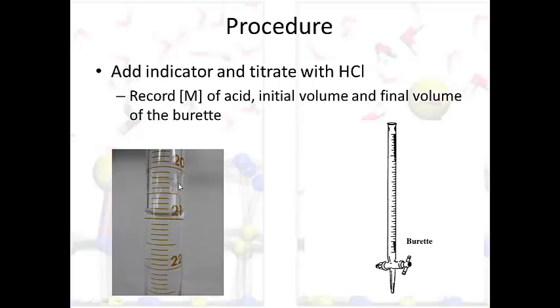So in this case, you can see how the burette's graduation markings here are upside down because we are dispensing. So here's 20, 21, and 22. This starts out at 20. It's more than 20, but less than 21. And then you can measure quite easily these graduations. There's 5, 6, 7, 8, 9, and that would be the 21 mark. But you can see that you can estimate that this meniscus is between the 20.9 and the 21. So I would read this as 20.9, say 6. 20.96. So you would record to 2 decimal places for your burette.